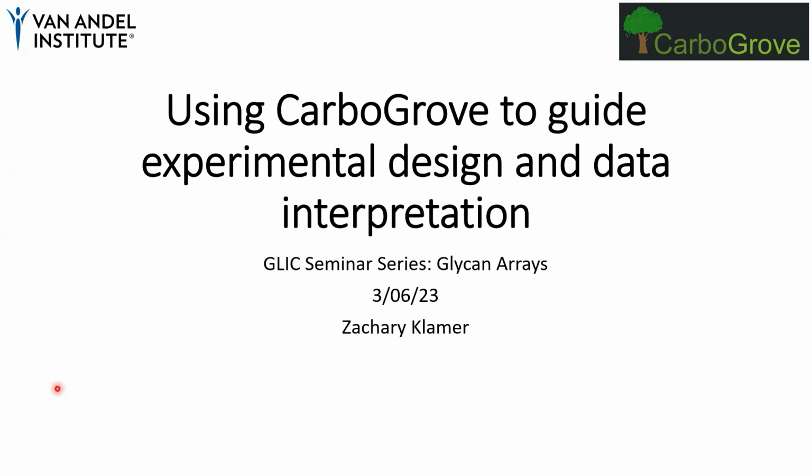The last two seminars that you heard about were software tools that can help you analyze your glycan array data. And you have seen from Akul and from Yuki, there are different ways how you can approach that and different kinds of displays that can be helpful for you to look at the data: heat maps, tables, bar charts, and so on.